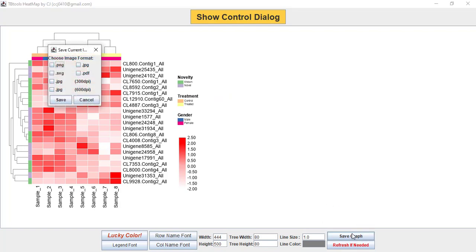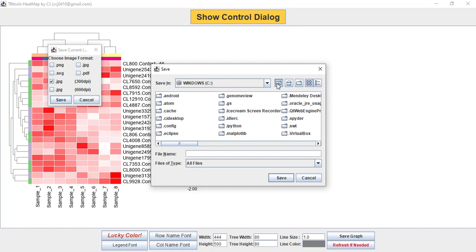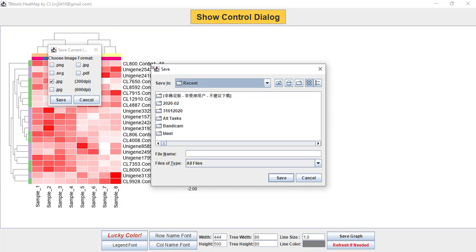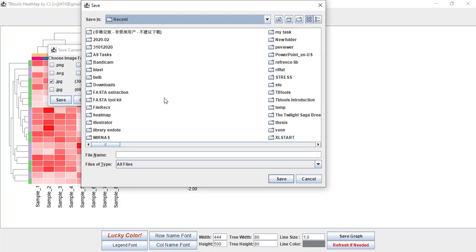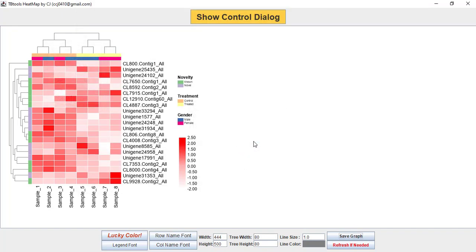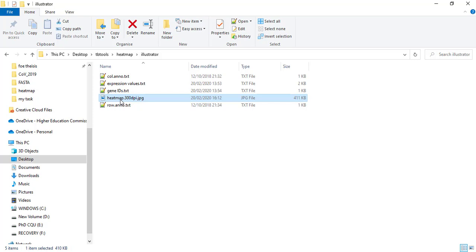Then press Save Graph. It will give you multiple formats — you can save in any format you need. I am going to save as a JPG at 300 DPI and give it a path. So now it is saved. Press Save and it will automatically save your file. Here you can see it is saved.